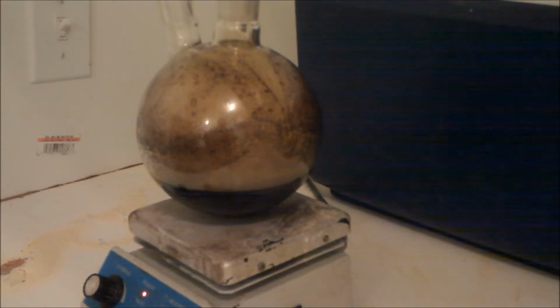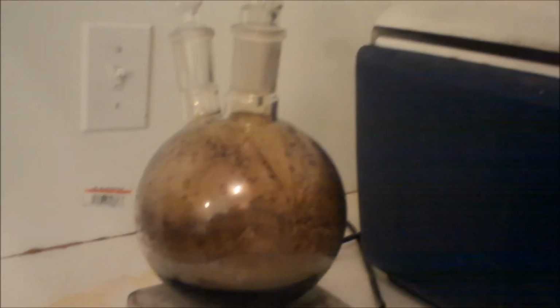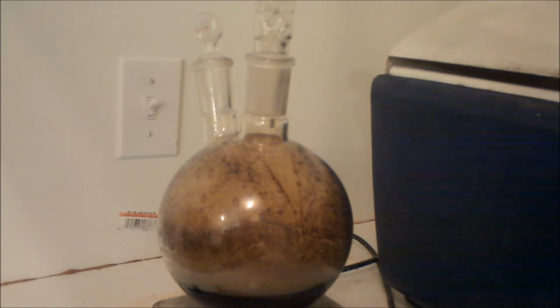Okay guys, so it was almost right after I turned off the camera, around 15 or 20 seconds after that, I started seeing gas forming. You can see it's a brown color. It's a thin brown gas right now, and I'm waiting for it to start going up that column, and hopefully it'll form a heavy vapor, and I will soon be able to get distillate coming over, and I can show you guys that.